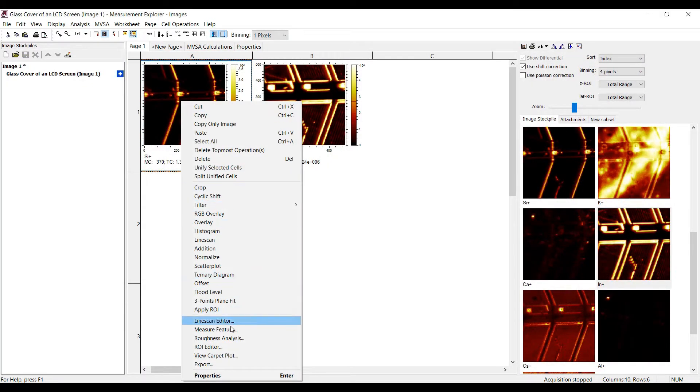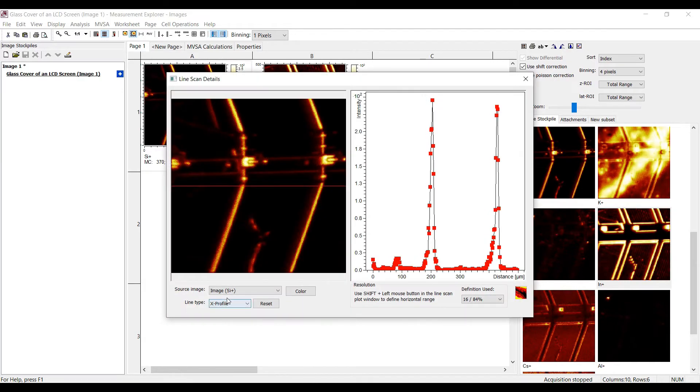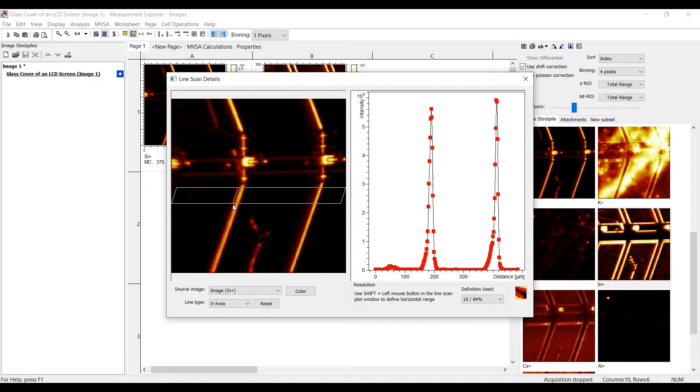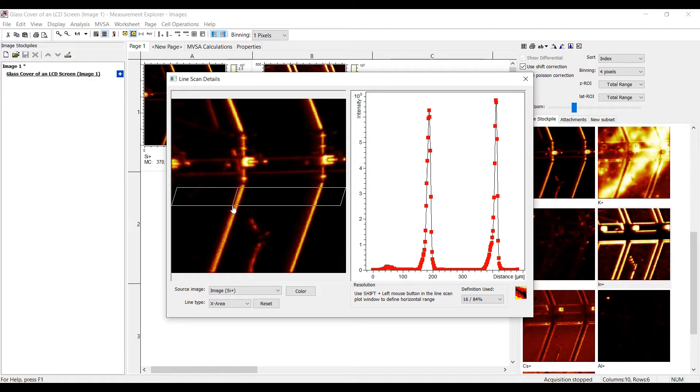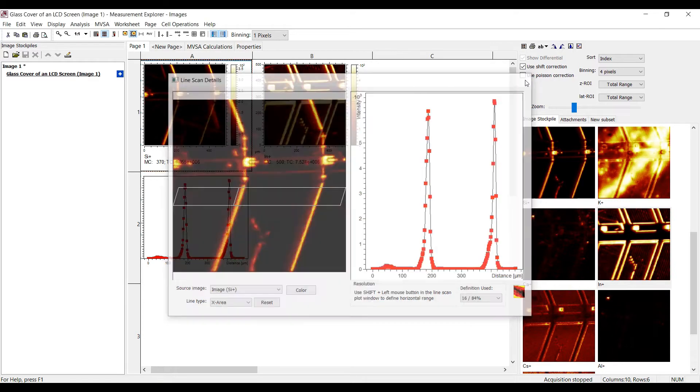Let's focus on the line scan editor next. A line scan shows the intensity as function of the position across an image. Have you ever wondered what this colorful button down to the right is there for? It copies the line scan to the worksheet. Keep this button pressed, move the mouse to a cell on the worksheet and release the button.